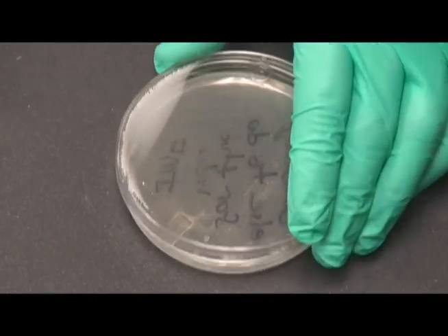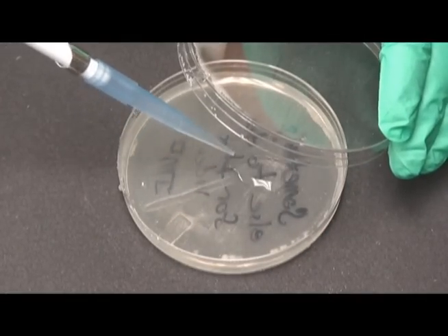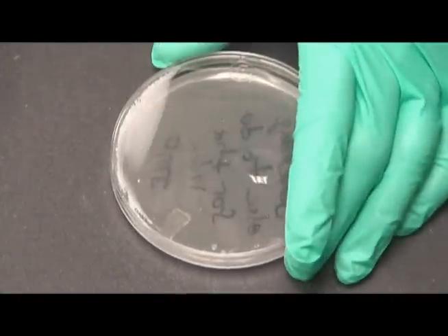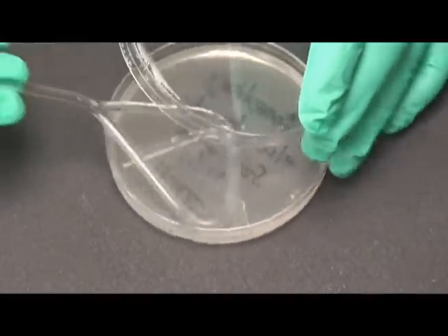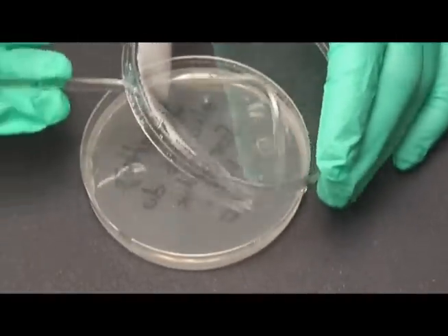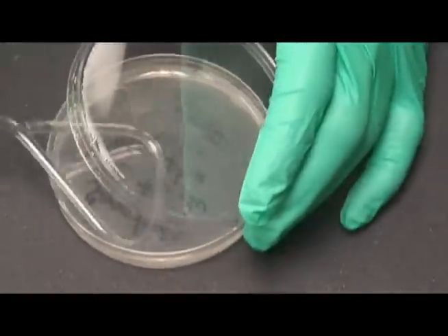On two separate special LB and ampicillin plates, plate 10 microliters and 100 microliters of the competent cells containing the plasmid DNA. Spread the cells in a circular manner using a glass sterilized rod. If unfamiliar with how to do this, review the fire safety video.